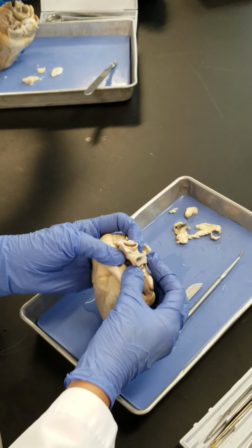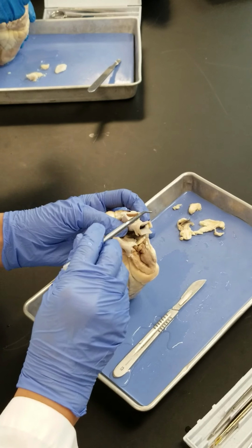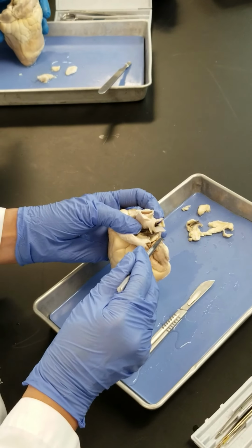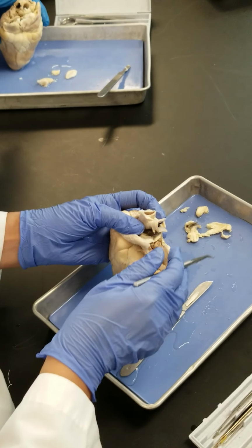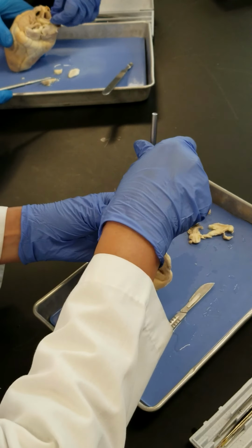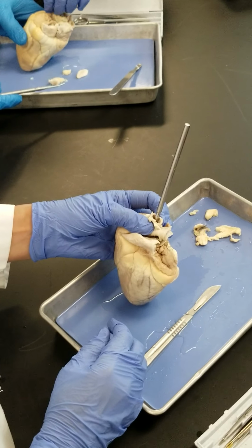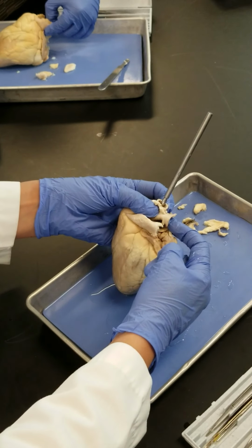So here you see that this is the arch of the aorta that has been cut here. If it hadn't been cut, you could see the other two branches too, right? Sometimes in some of the hearts they have been cut further, so you may see the other branches. But here you have only one branch. This one that goes toward the up goes toward the head and neck on the right side, right? This is the brachiocephalic trunk, this is the aortic arch.